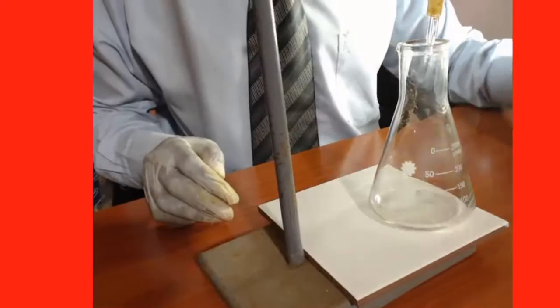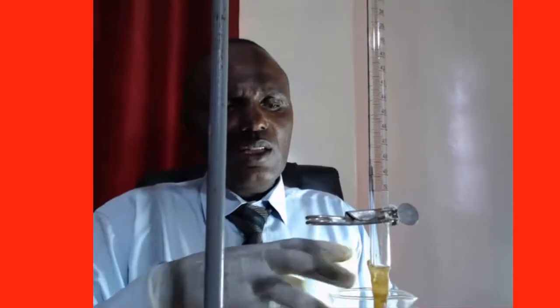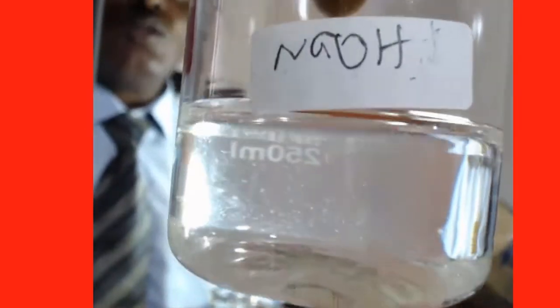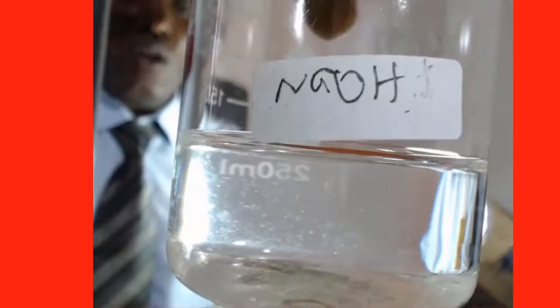Let us now titrate the solution of oxalic acid we prepared. This is a solution that we prepared of oxalic acid. It is 0.25 M. This solution is of sodium hydroxide, and its concentration is unknown. We want to standardize it, or in other words, we want to know its concentration.